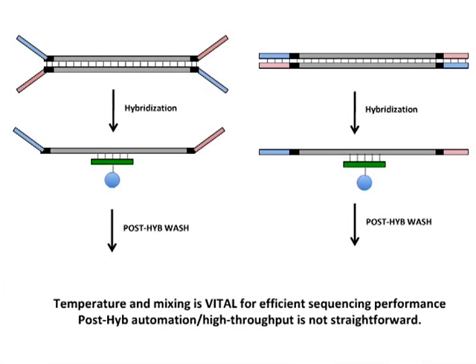And so once the automation schemes are worked out and the testing is done, an advantage of having it automated is being able to very routinely or very robustly control those parameters so it is extremely highly consistent from one run to the next to the next.